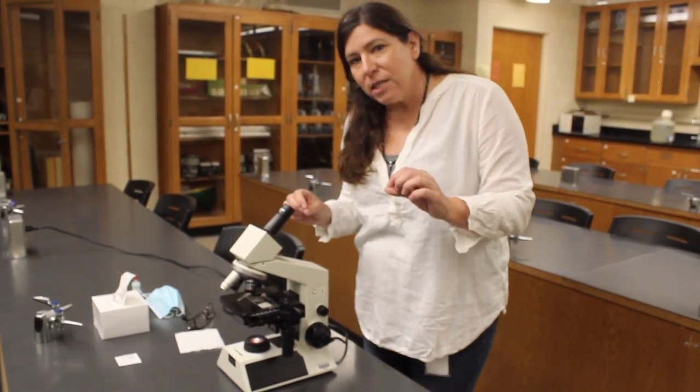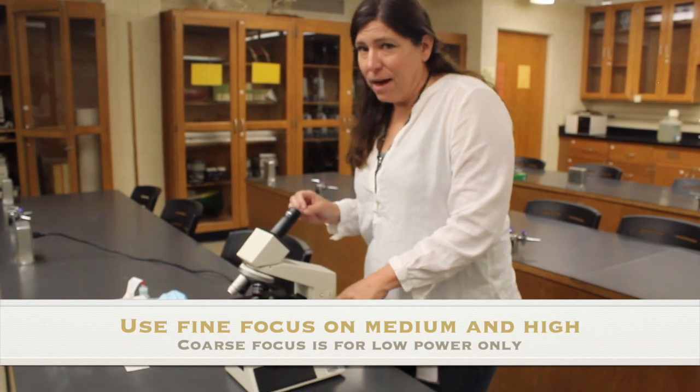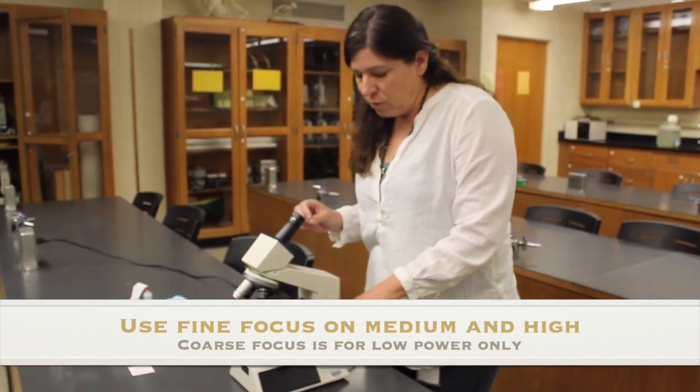I want it to be crisp. And so I'm going to use my fine focus, not my coarse focus at this time. The coarse focus is only when you're on low power. Notice that the letter E is still centered and looks much bigger, but it is slightly out of focus. So we're going to use our fine focus to get it nice and crisp.